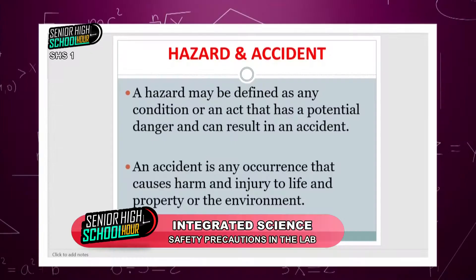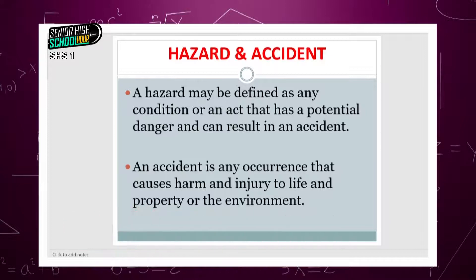The question would be: what is the difference between a hazard and an accident? Most times you say there's a car accident, but when buildings collapse, we don't call it an accident. In our field of science, there's a difference. We define a hazard as any condition or act that has a potential danger and can result in an accident. A condition or act that has potential danger doesn't mean it has caused the problem — it can trigger it or cause it. Once that action takes place, then we say it's an accident. We define an accident as any occurrence that causes harm and injury to life and property or the environment.